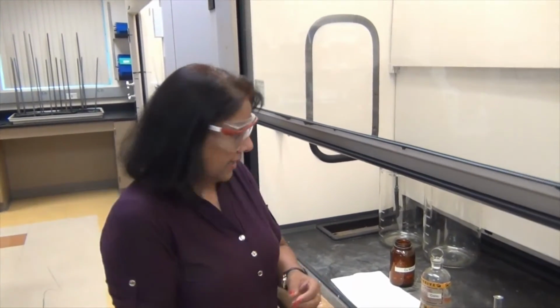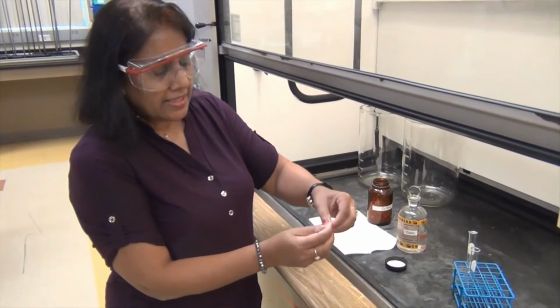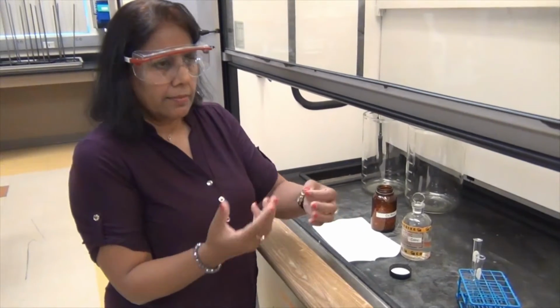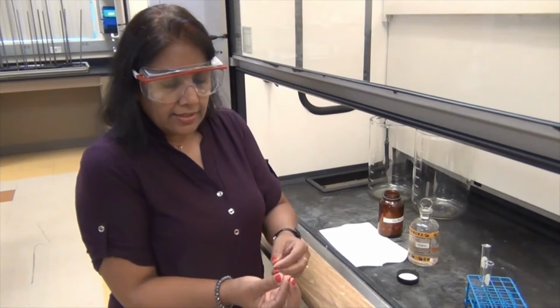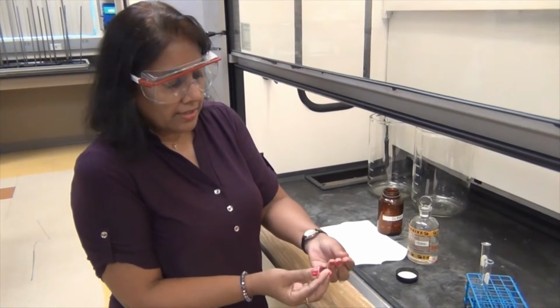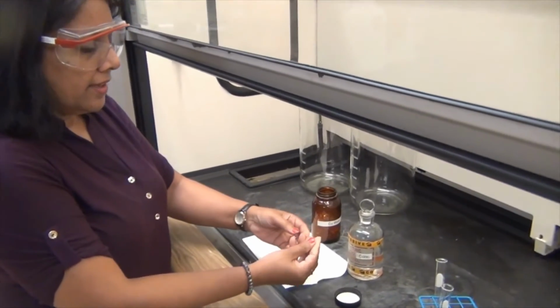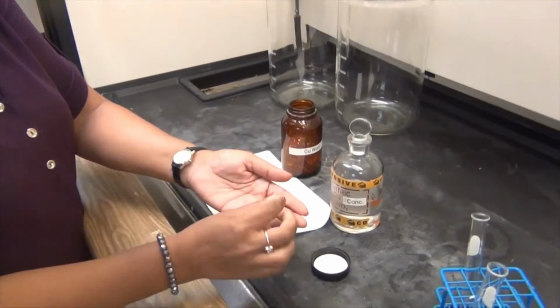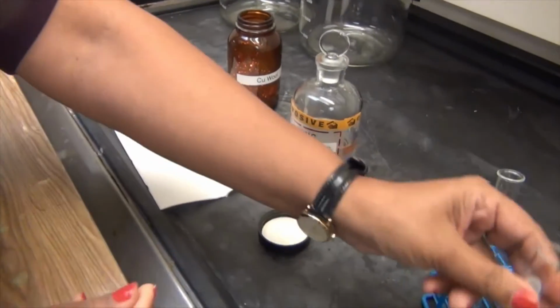So here I'm taking a little piece of copper, and you can see it's a wire kind of thing, and we get metals in different shapes and sizes. We get them in rods and pieces, and you've used magnesium strip already. This is a wire, okay? So I'm going to take this copper wire and just take a little bit of it. Remember, we're not weighing anything, so I'm just going to make it a little bead over here in my hand and put it in a test tube.